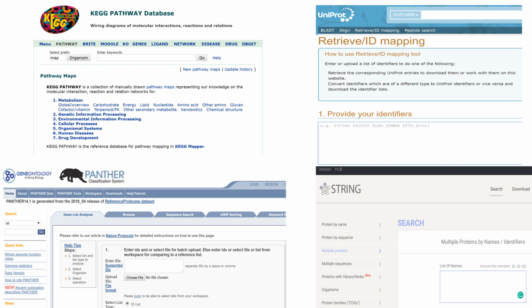Simultaneously, we can also perform an analysis where we can find which proteins are being expressed in a more abundant form in the treatment and less abundant in the control, which proteins are being expressed more and which proteins are being expressed less. Now, once we have that information, we need to find out what those proteins do inside the cells, which part of the metabolic process they're under. To find this, we can use either UniProt or PANTHER.